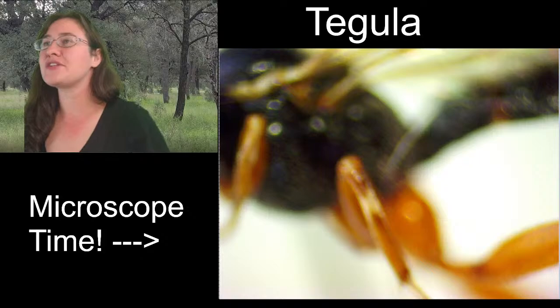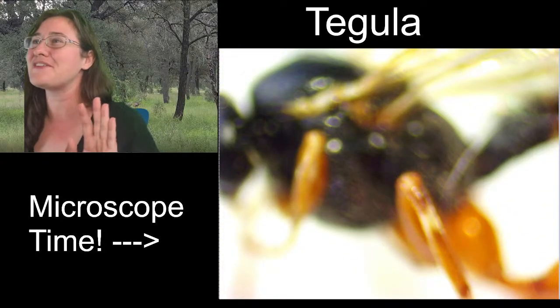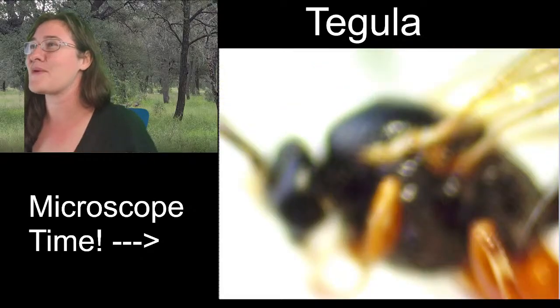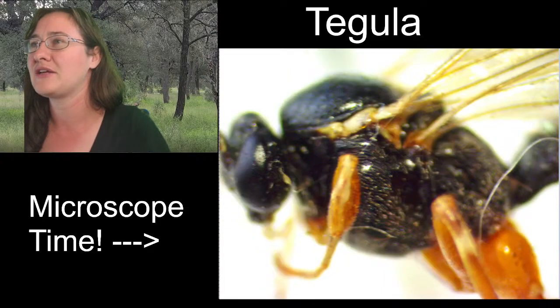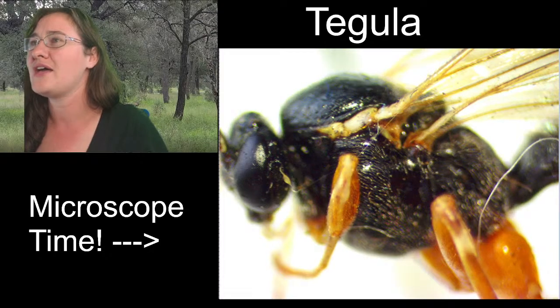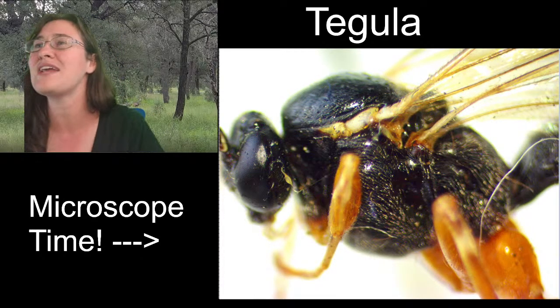All right, we've gotten a little bit of a view of all over our thorax now. So now I've got to pick one view and stick with it so that we can sketch it together. And I'm thinking that I want to zoom in, but I'm not going to focus too much on the legs just yet, just the body. And I might even zoom in so that we can look at defined characteristics on the tegula. But right now, we'll start here.